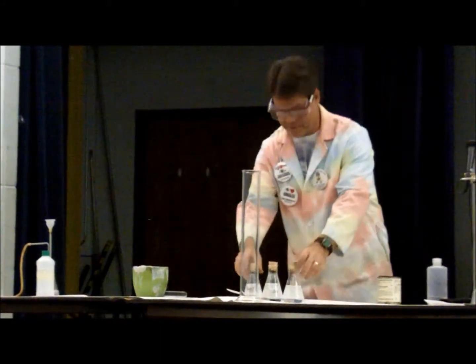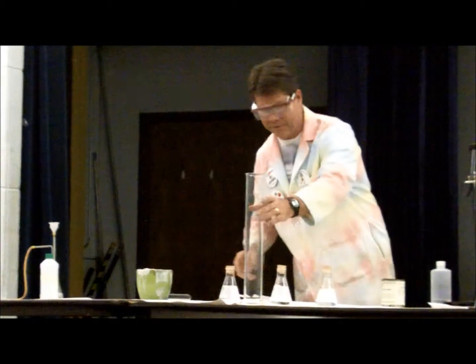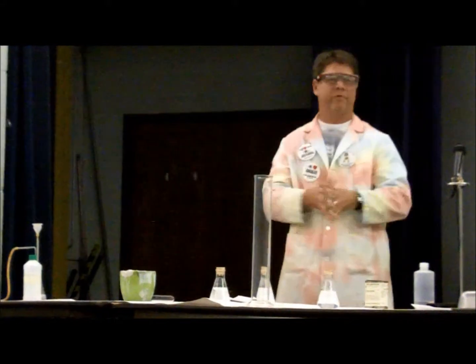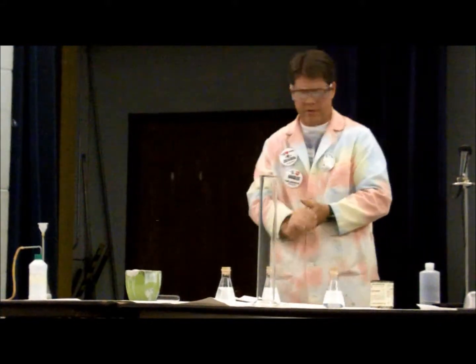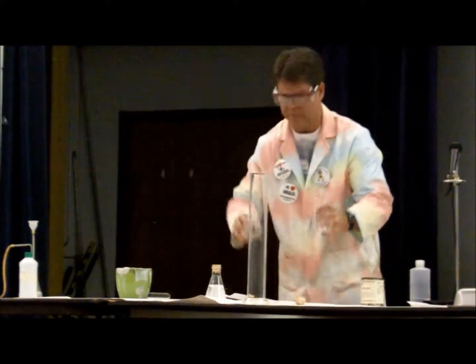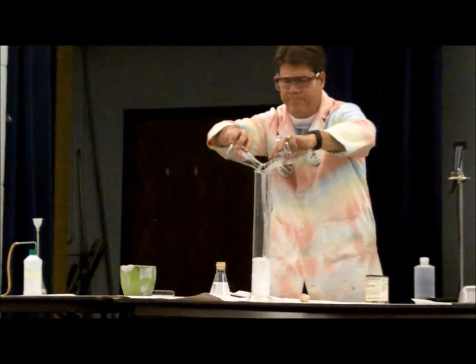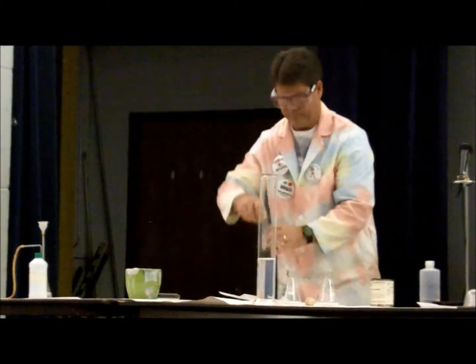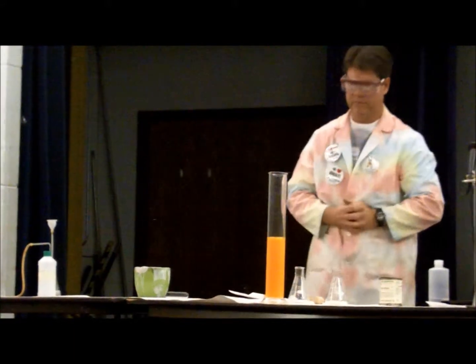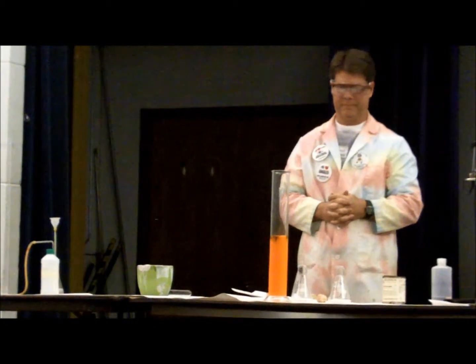And this one has nothing to do with combustion. It's just purely for entertainment. What I'm going to do is make 2 compounds in a row from these clear solutions, and both those compounds won't dissolve in water, and they also have some interesting colors. So let's take a look and see what they're going to tell us. There you go. Happy Halloween.